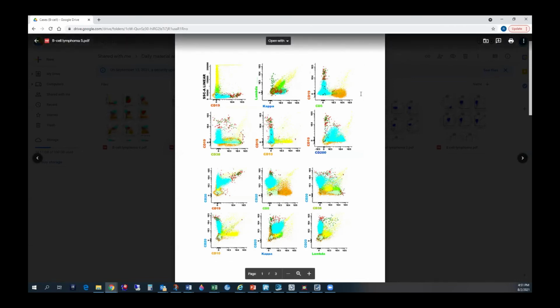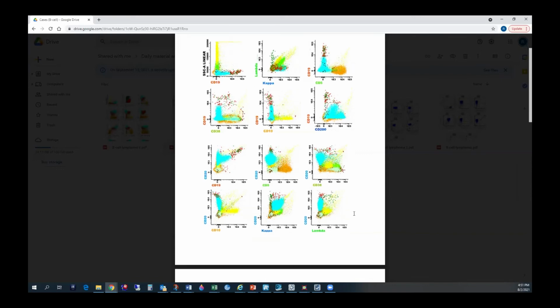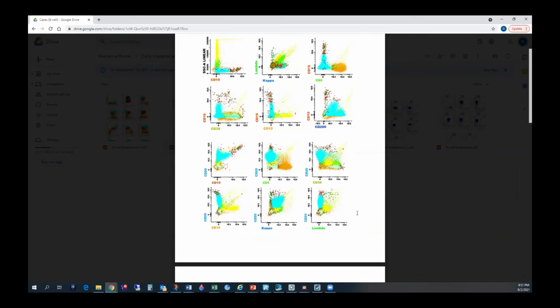But the majority of the cells that we are trying to see here are the B cells. Your B cells show dim to negative CD19, and they don't have CD10. They have partial CD200. They have CD20. So this is how you can say that they are not just plasma cells, because you have 20 also. So this is LPL then? Right, this is an LPL, but abnormal plasma cells can still express a little bit of 20. We need to be careful.